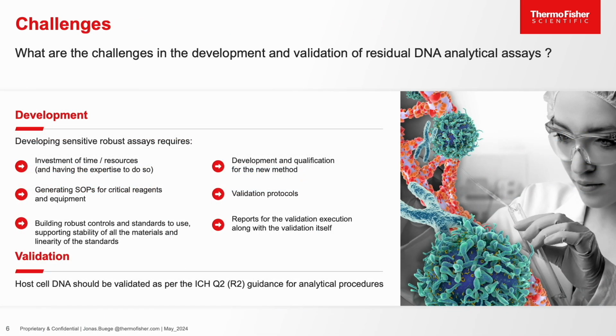So let's start by talking about residual DNA quantitation. There are several challenges to developing and validating a residual DNA analytical assay. Developing an assay requires time, resources, and expertise, SOPs, controls, protocols, and the necessary experiments that demonstrate the assay, along with reports that support validation of the method.